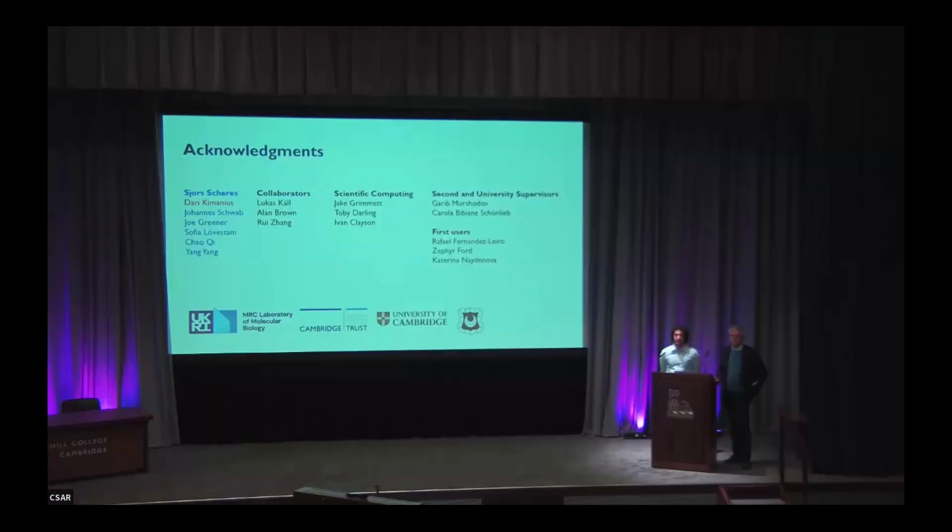If I could ask a follow-up question, more of a big picture style question. I know cryo-EM has come a long way in the last 10 years. How much would it cost from a user perspective to express the protein in bacteria, purify it, then go to a cryo-EM machine, take the data, then analyze it? What would the cost be from step one of purifying the protein to getting the structure? Do you have a ballpark of how much that would actually cost?